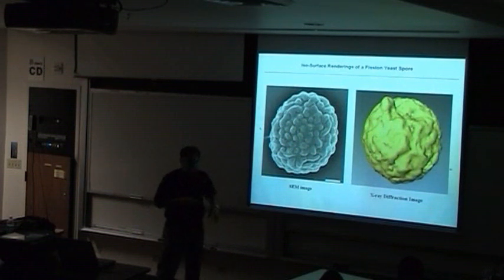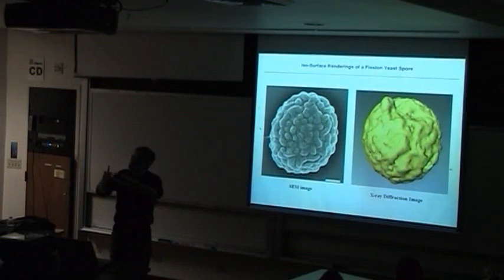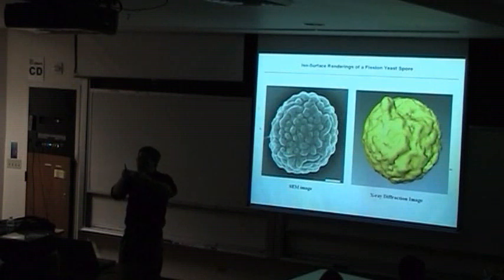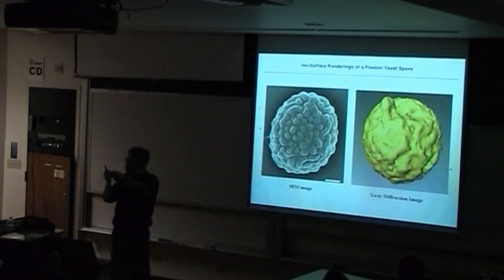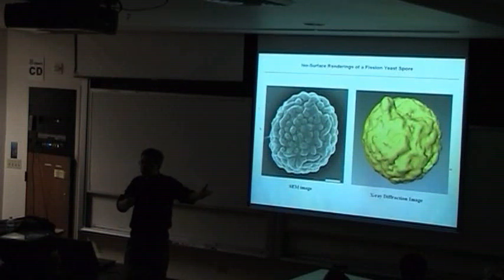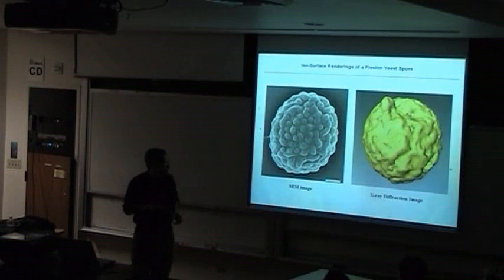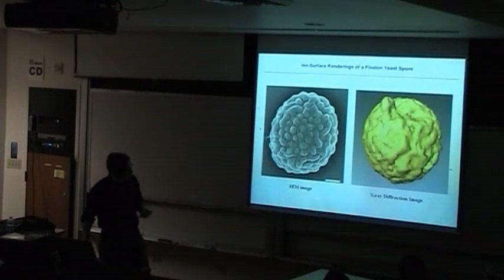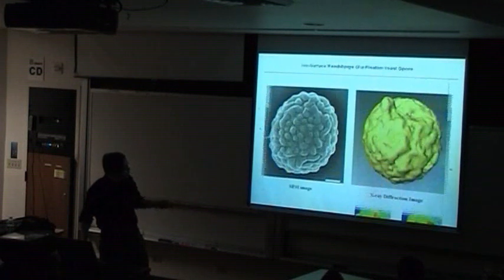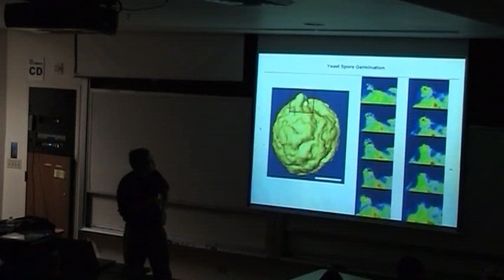Yeast spore is actually very bumpy. At low nutrition, each fission yeast forms 4 spores. The spore is very tough; if you put it in the desert, after a few days it can still survive, and if you give it a suitable environment, each spore becomes a yeast. Here we noticed something sticking out, and we found this is actually spore germination.